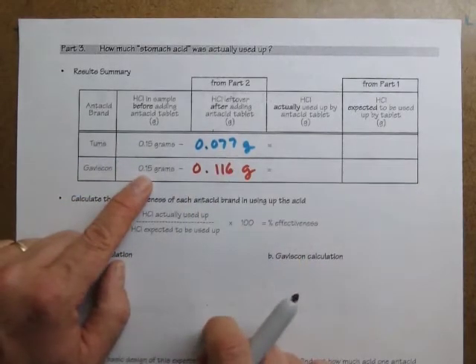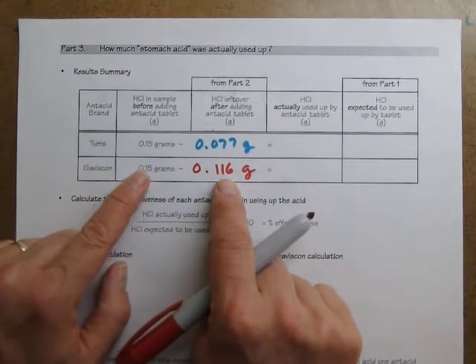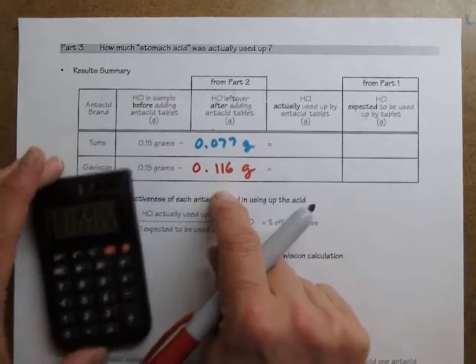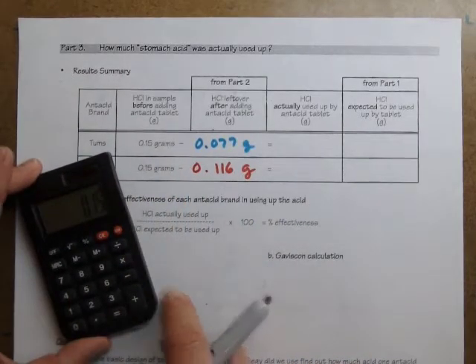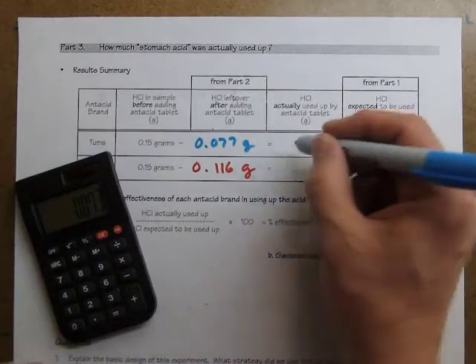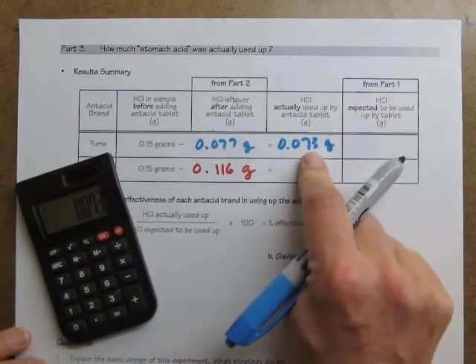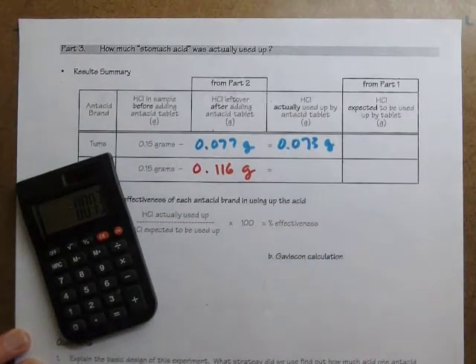Of the 0.15 grams in the Gaviscon sample, this is how much remained out of the amount that was started with. And so how much was used up? Let's subtract to find out. So the 0.15 grams that was originally in there minus how much was left is 0.073 grams. That's how much acid the Tums actually used up out of the acid that was in the sample to start with.